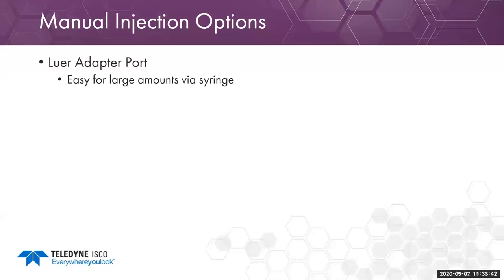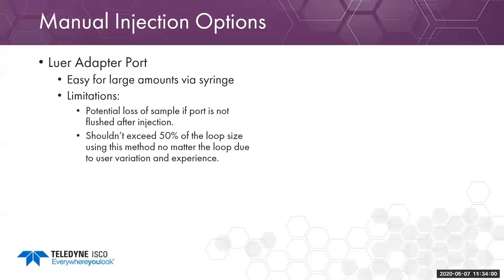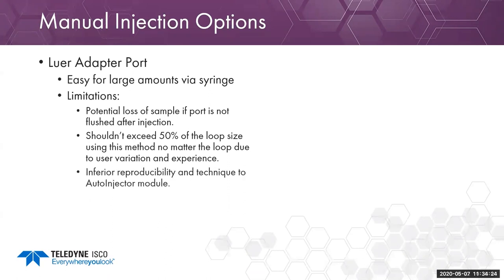For manual injection, the luer port adapter is easy for large amounts via syringe, but has limitations: potential sample loss if you don't flush after injection, and you shouldn't exceed 50% of the loop size due to user variation and experience. As you inject, you create a laminar flow profile — sample starts to exit the back of the loop. You don't want to exceed 50% of the loop size using the luer port adapter.